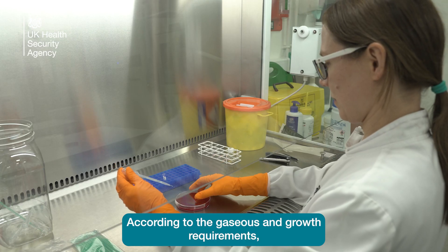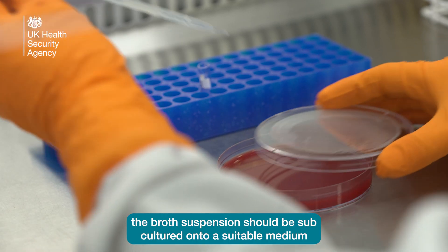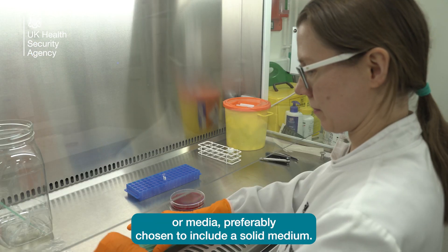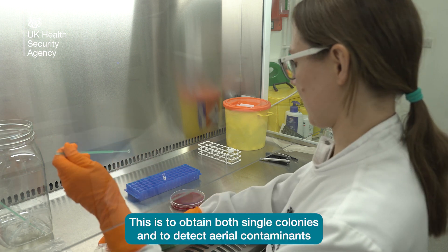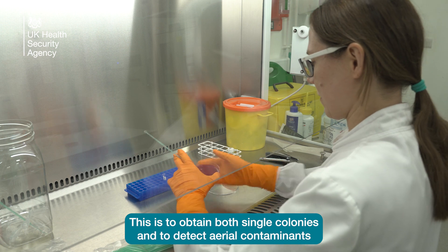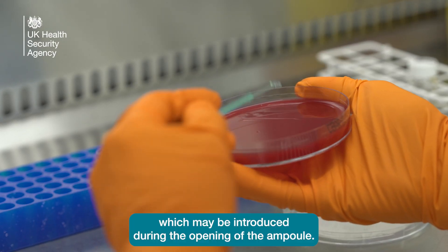According to the gaseous and growth requirements, the broth suspension should be subcultured onto a suitable medium or media, preferably chosen to include a solid medium. This is to obtain both single colonies and to detect aerial contaminants which may be introduced during the opening of the ampoule.